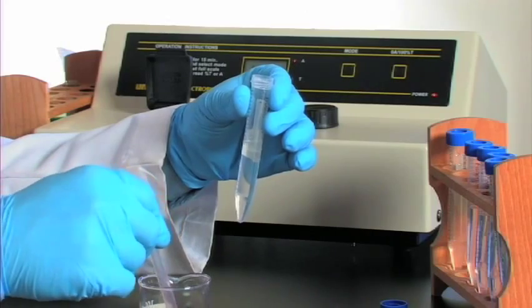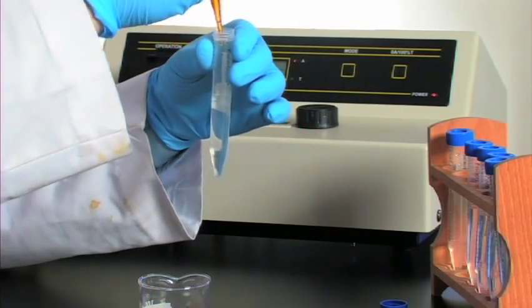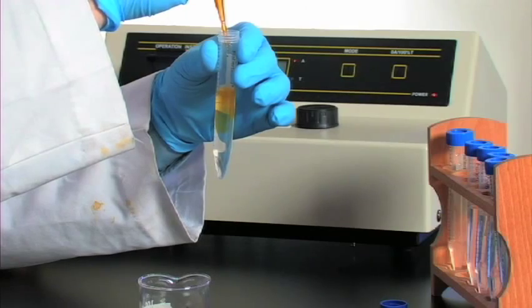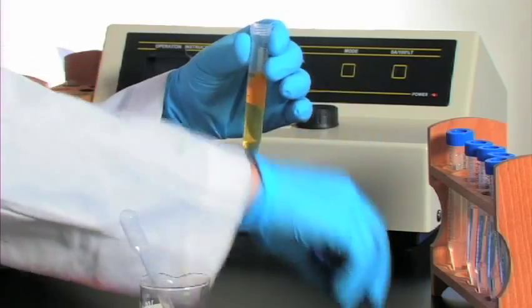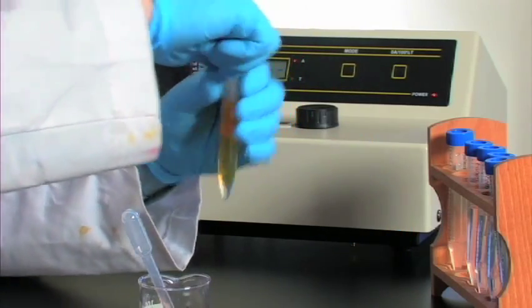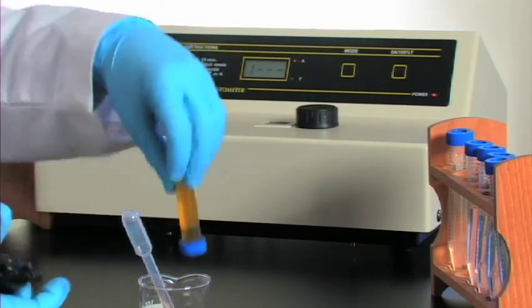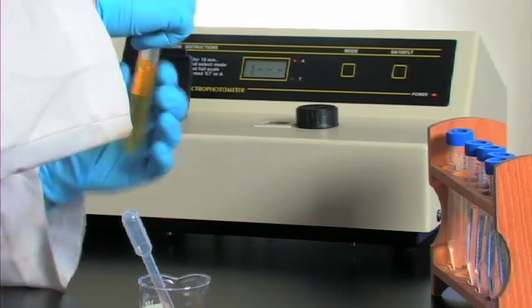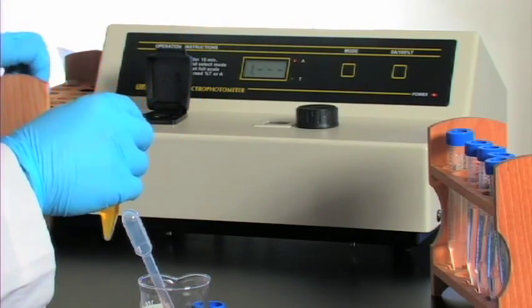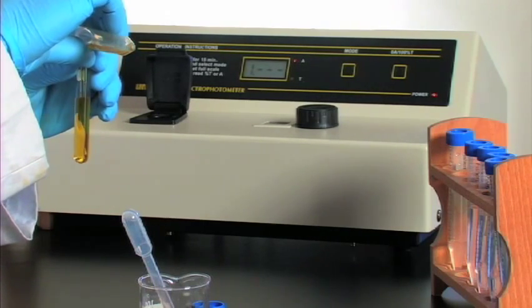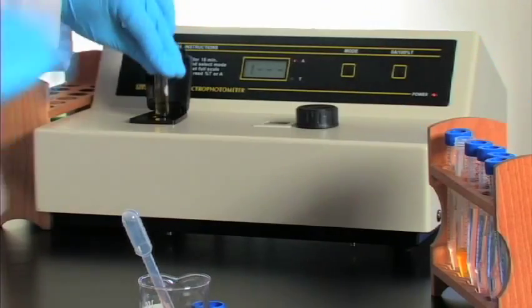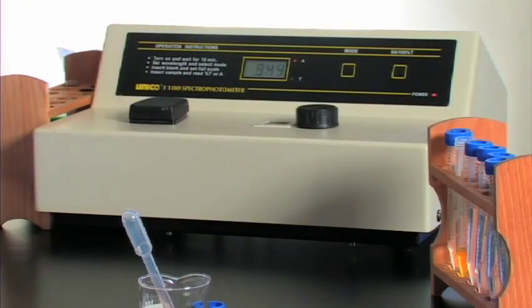Remember in tube number two there's a higher concentration of acetone. So we start the reaction and now with the increased amount of acetone we're going to take a look at how this affects the disappearance of the iodine. We quickly and carefully transfer it to the cuvette, place it, and watch what happens.